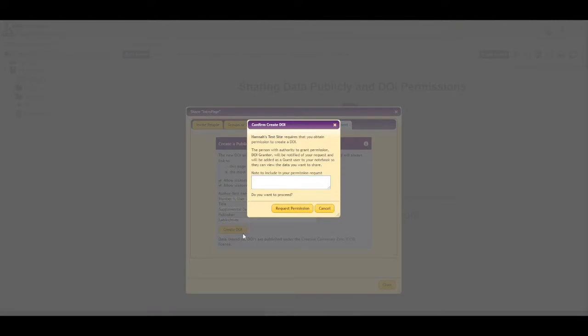Your institution may require that you get permission to create a DOI. A designated individual at your institution will be added to this part of the notebook as a view-only guest. To provide them with more information, you can add a note for them.